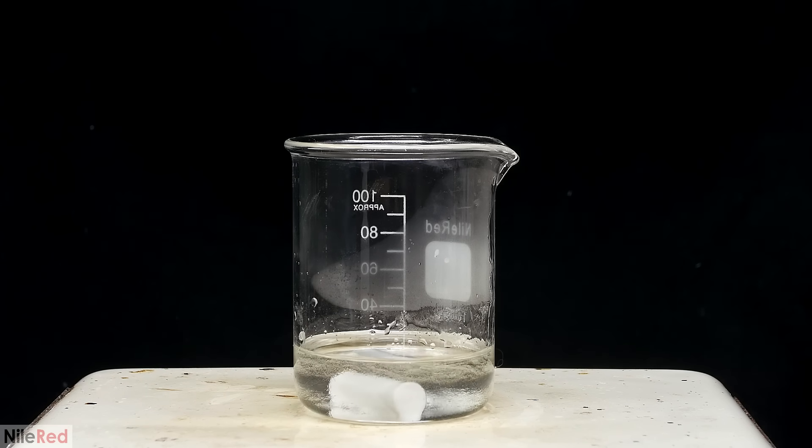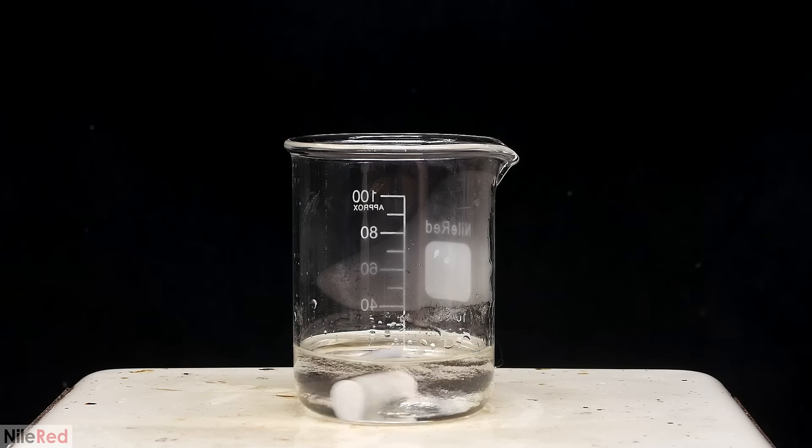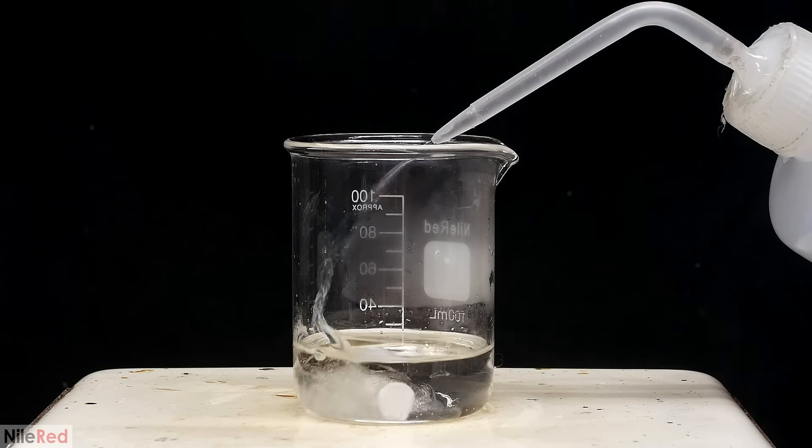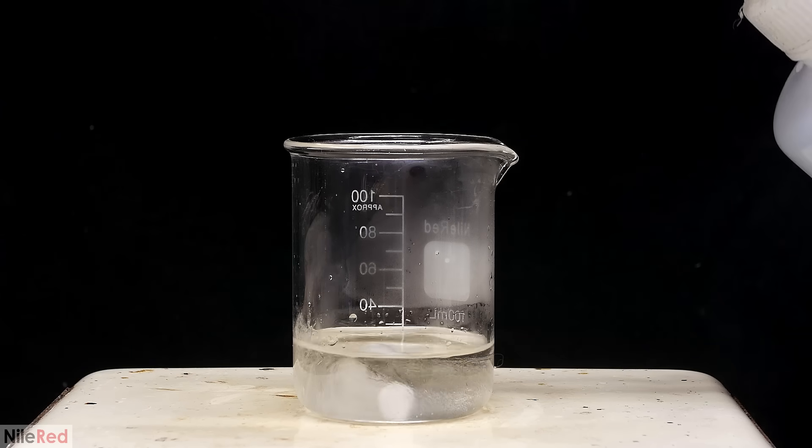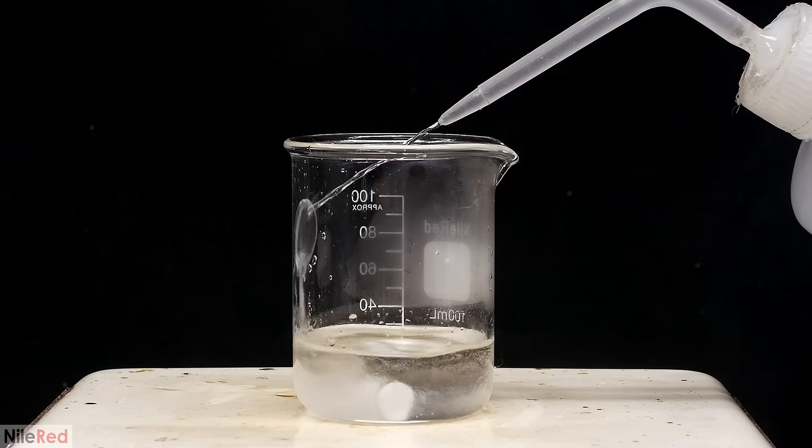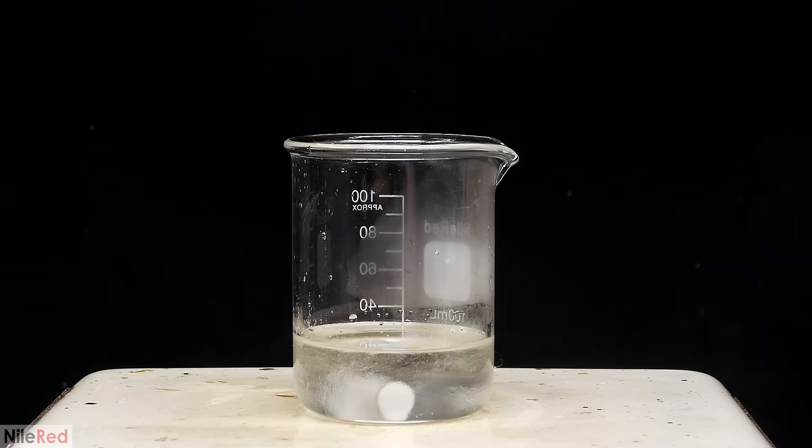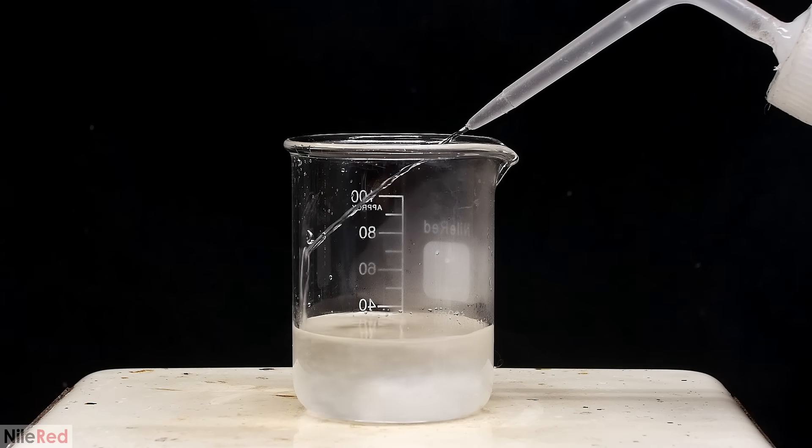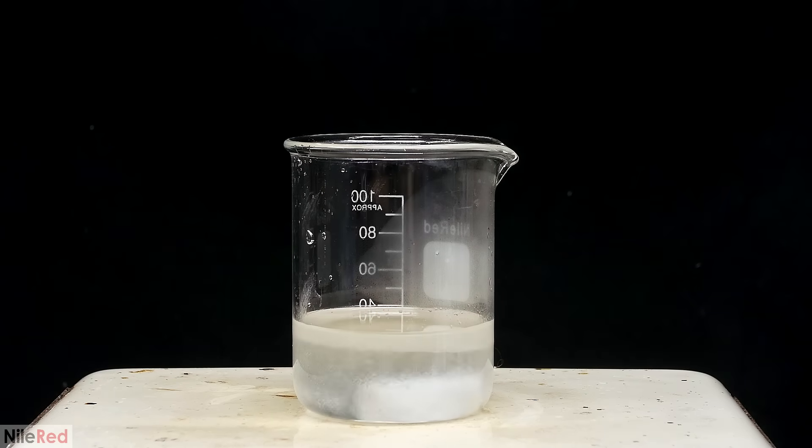The first thing that I need to do is dissolve all of the chlorobutanol in a minimal amount of boiling or near boiling ethanol. When everything is dissolved, I start adding water which will reduce the solubility. The basic idea is to find a balance where the chlorobutanol is just barely soluble in the hot mixture. This way, when the solution cools down, the solubility of the chlorobutanol will decrease, and it should crystallize out.